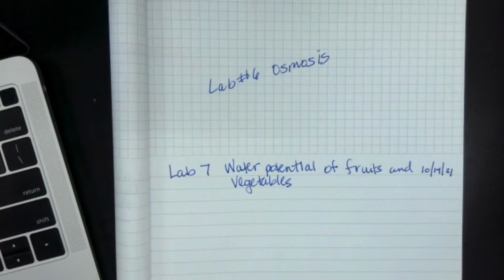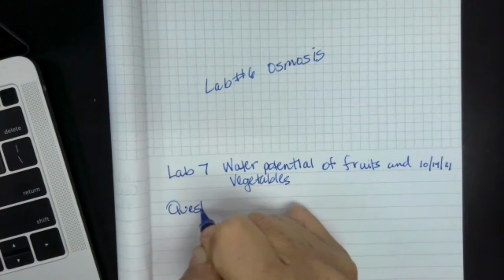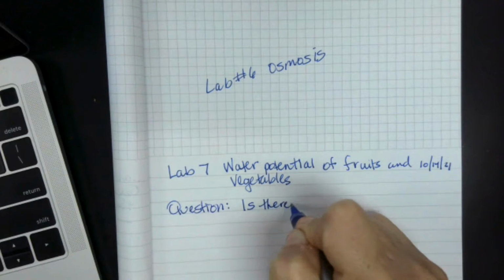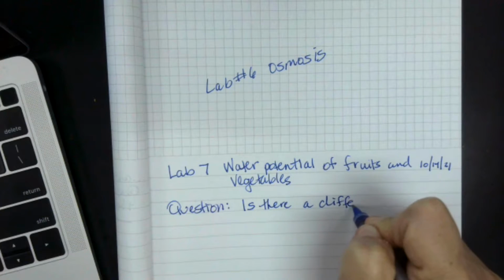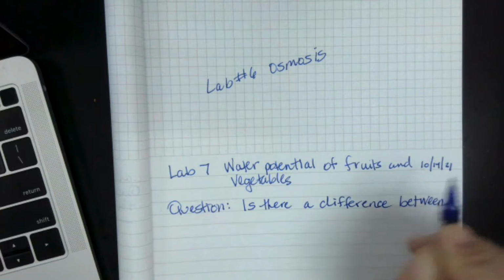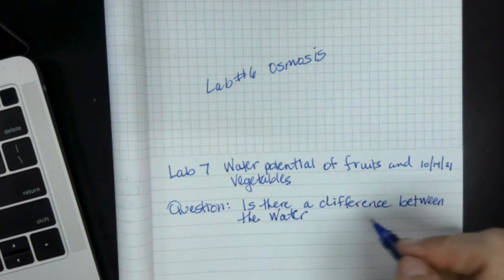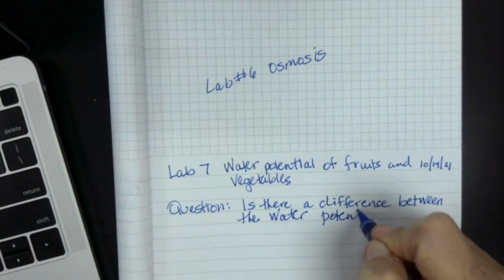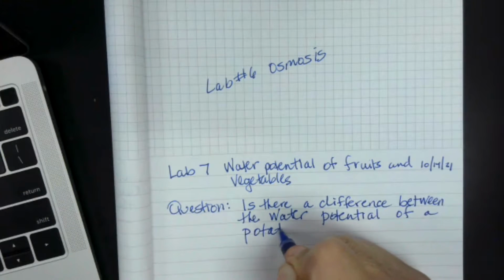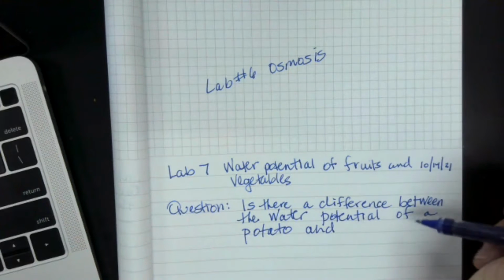The question is going to be: is there a difference between the water potential of a potato? You should write this as you go with me. Everybody's going to test the potato, and then you're going to pick another vegetable.